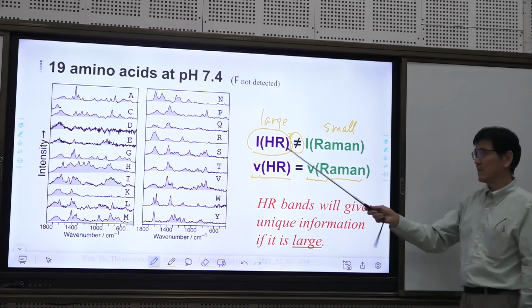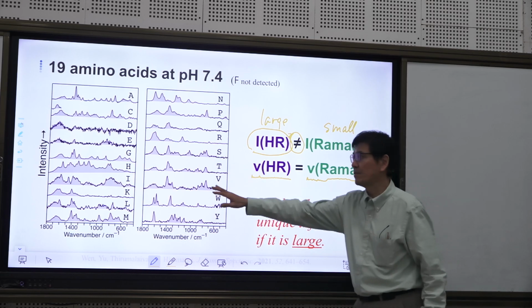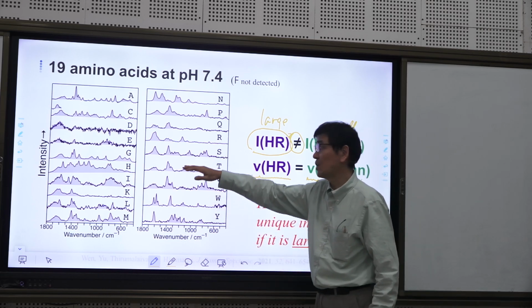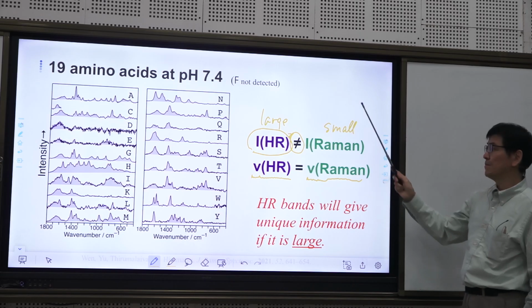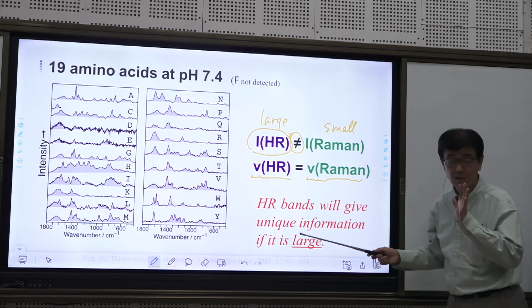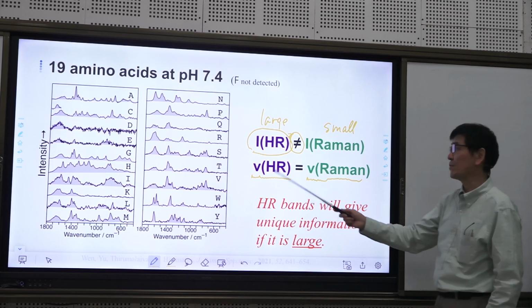But you know, the hyper-Raman signal is very weak, and we need to spend a long time to get a good result. One spectrum is measured in 2 or 3 hours for each result. So if we discuss only the peak position, we do not need to pay much effort to record hyper-Raman.